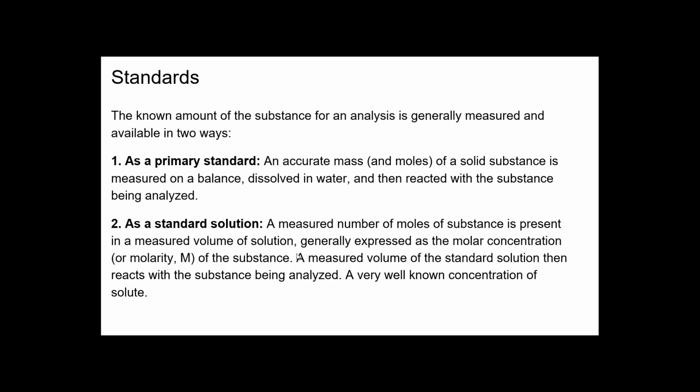Standards. The known amount of the substance for analysis is generally measured and available in two ways. As a primary standard, an accurate mass and moles of a solid substance is measured on a balance, dissolved in water, and then reacted with the substance being analyzed. As a standard solution, a measured number of moles of substance is present in a measured volume of solution, generally expressed as molar concentration, or molarity, of the substance. A measured volume of the standard solution then reacts with the substance being analyzed, a very well-known concentration of solute.